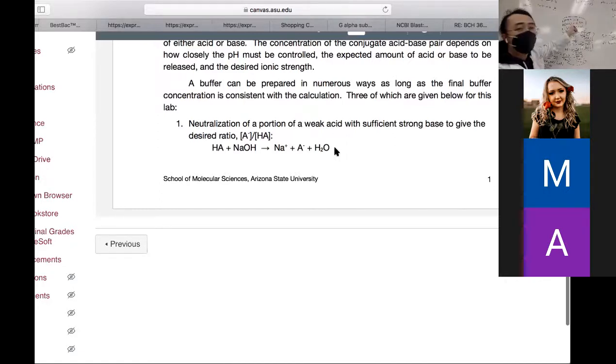The concentration of the buffer will be 0.1 molar, which is 0.1 mole per liter. The volume you are making for today's buffer is 50 milliliters, and like I said, the pKa value you are using is 7.2. Those are the factors I provided. You need to use these factors to determine how to make the buffers.